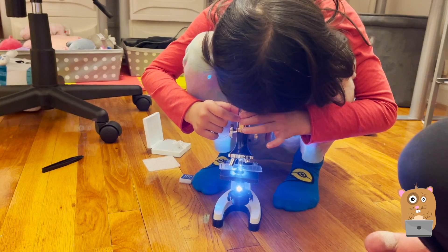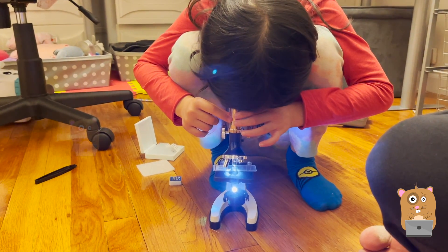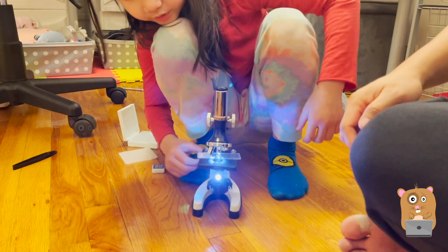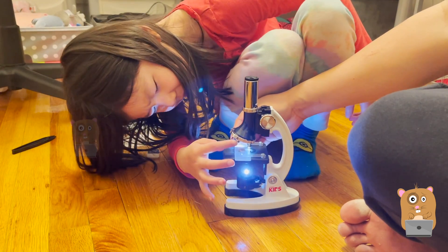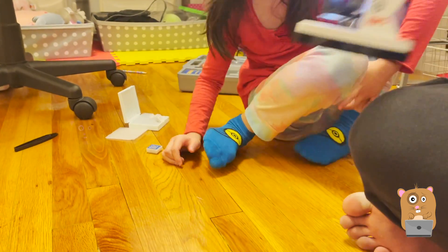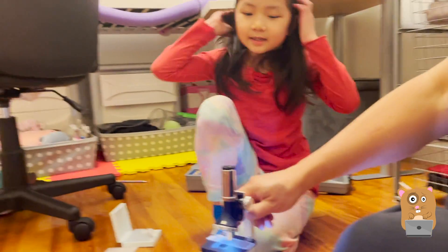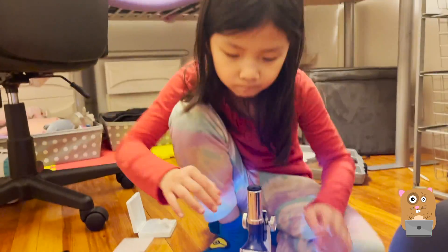Whoa! There are cells — when it's so small, there are cells. There are little streamy things, green stuff, bubbles. Whoa! Can we switch this again? Okay, go ahead, change the slide. I mean switch to that tiny one. Now you adjust. I'll change it back to the normal first. So this is zoomed out a lot — this is 300X. The maximum was 1200X. Whoa! See how different it is? Yeah.